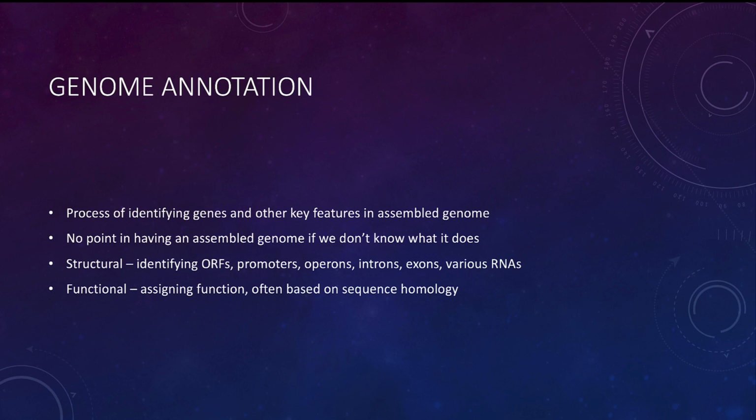Some of the tools that we'll talk about in a little bit for annotation are specific to prokaryotes. However, there are eukaryotic options as well. So if you end up being interested in doing eukaryotic genomes, we can chat and I can give you some of those ideas for tools as well.